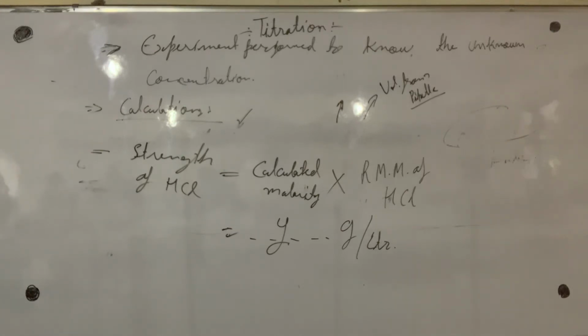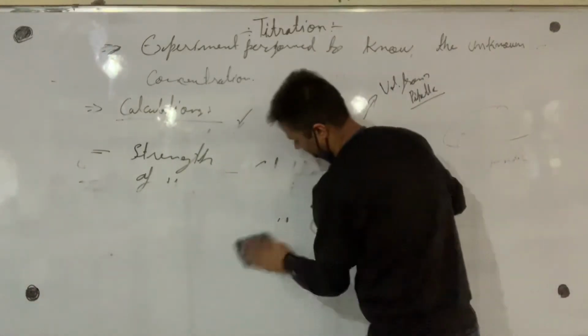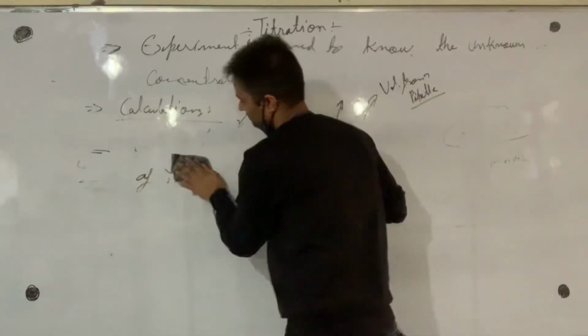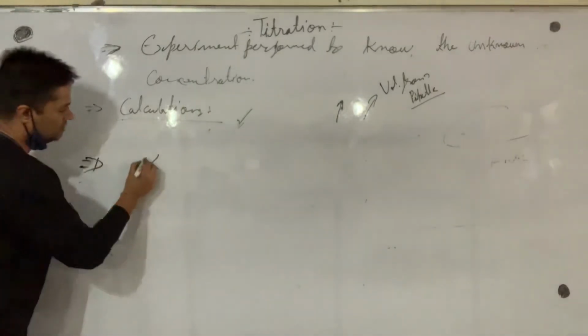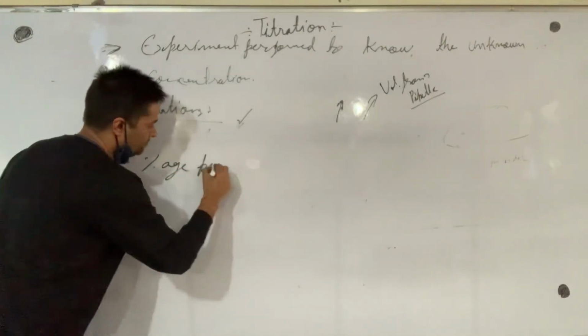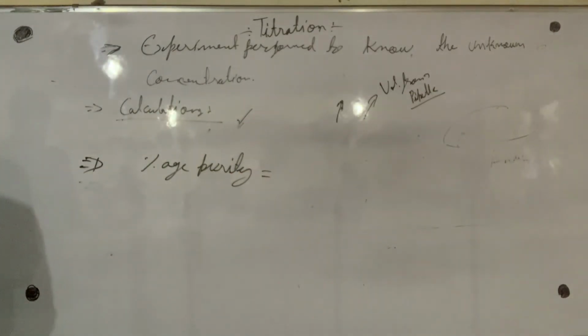Next is the calculation of percentage purity. Noted down this much? Next is percentage purity. Very simple formula. We have calculated strength.